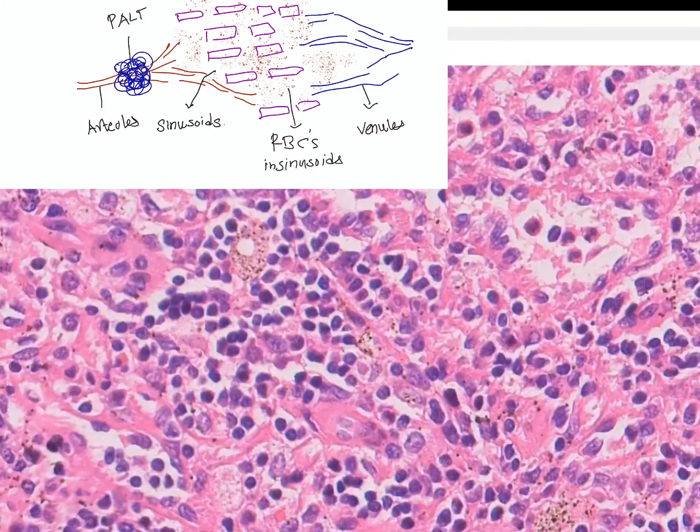These are the sinusoids lined by small endothelial cells. The gaps are wide and there are hemosiderin-laden macrophages along with lymphocytes and plasma cells. This is how the spleen looks, and you can clearly see the red-staining areas.